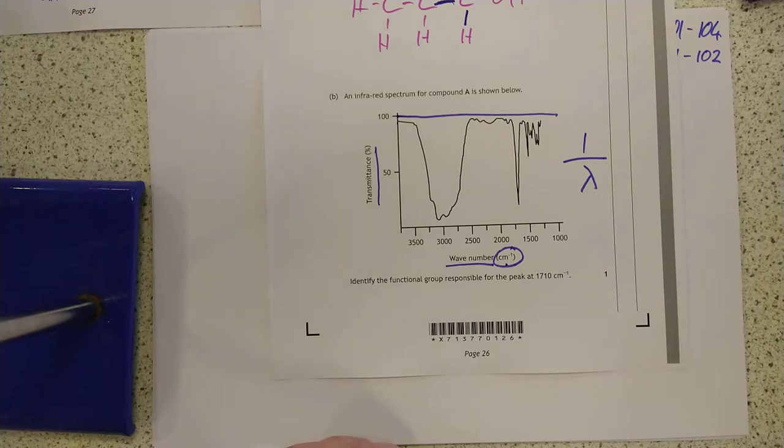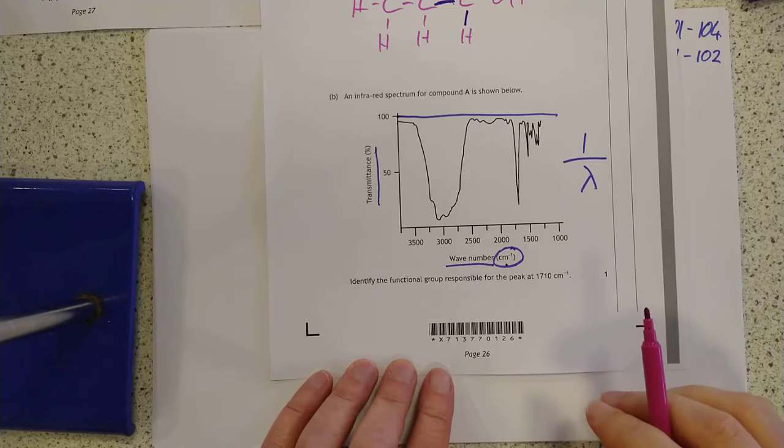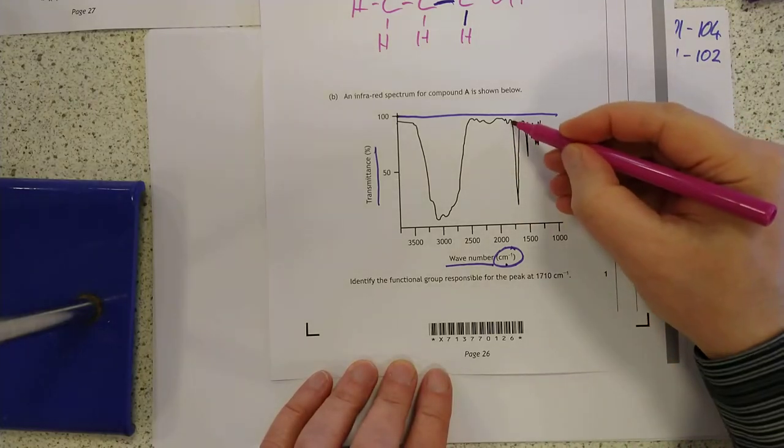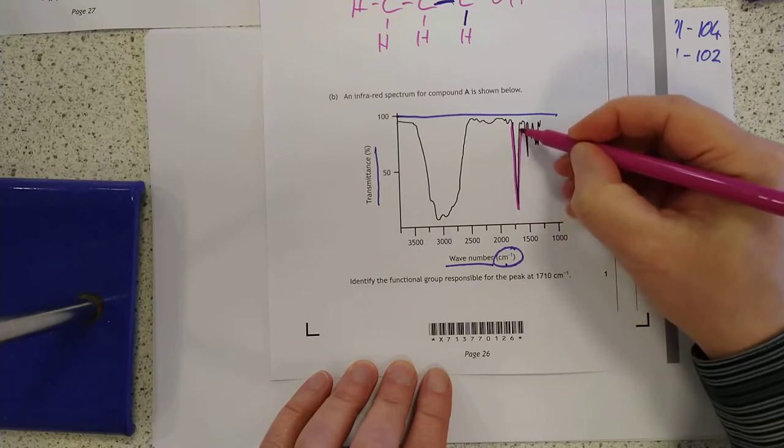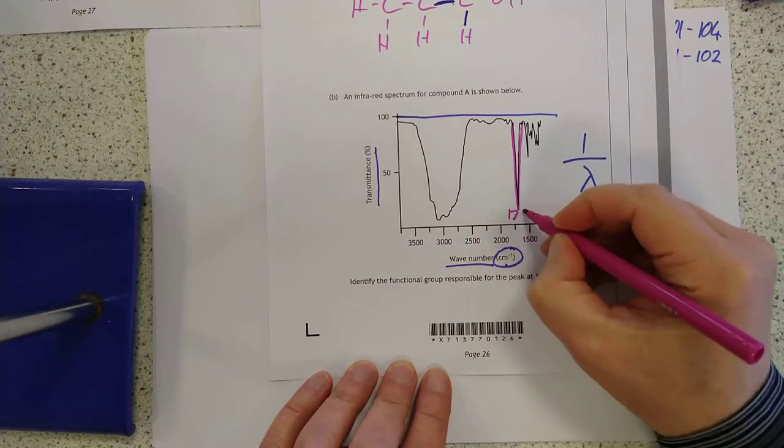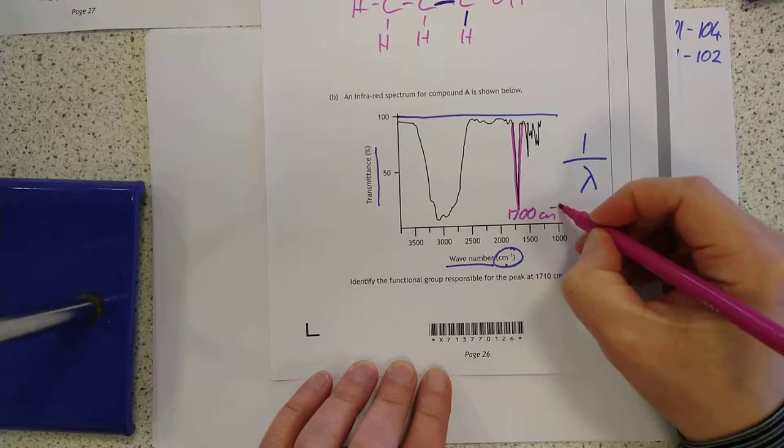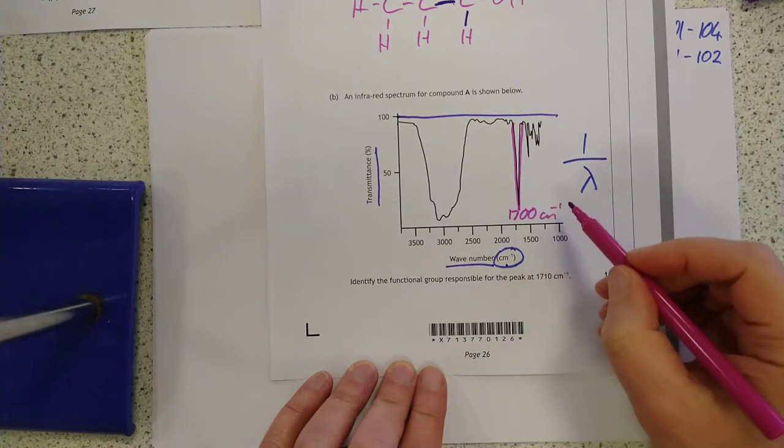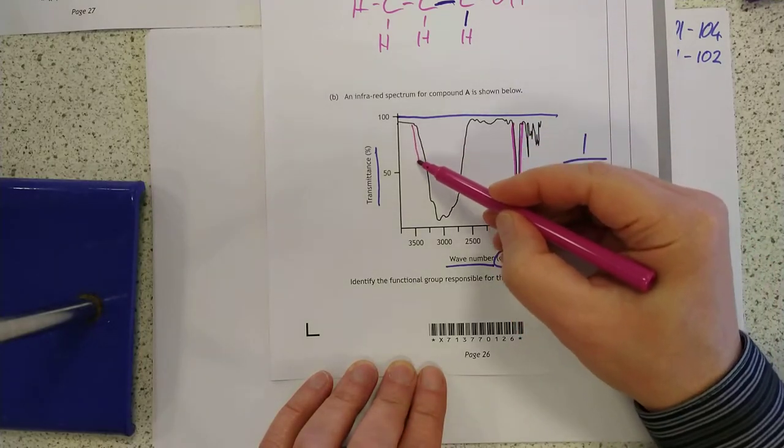In the meantime, let's have a look at a typical spectrum here. This spectrum here is peachy because it's got two of the favorite things they love asking about. It's got this big massive crystal clear spike around 1,700 centimeters to the minus one. Today's ridiculous unit. And it's also got this big broad blob here, around 3,000.